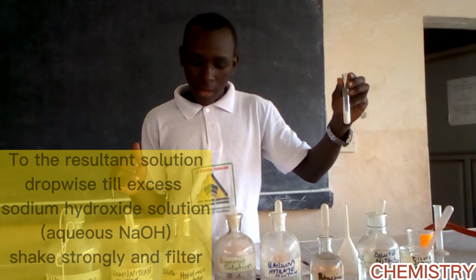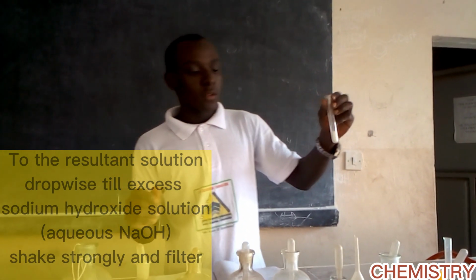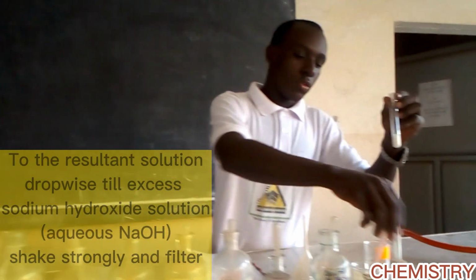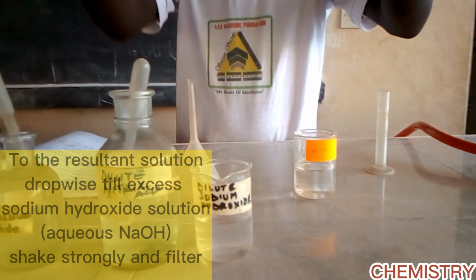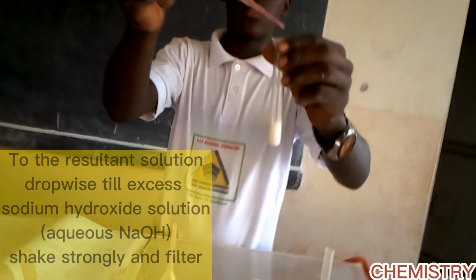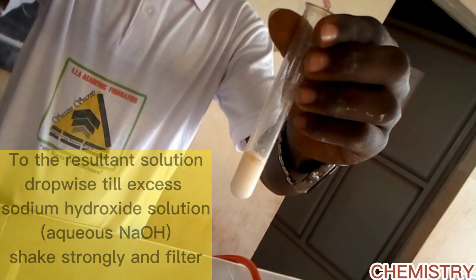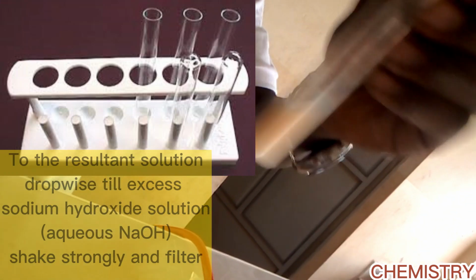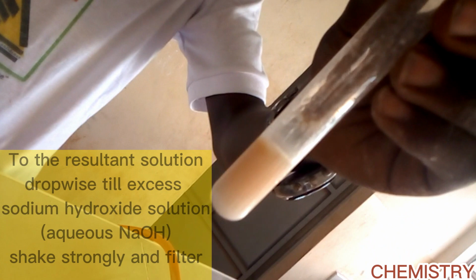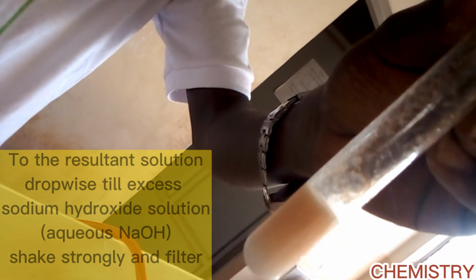To this white solution, they have said add sodium hydroxide dropwise and shake strongly. So we are going to add our sodium hydroxide, which is here, dropwise. As you can see, I'm doing it. They have said until in excess, so you make sure you add the sodium hydroxide. As you can see, the more sodium hydroxide we keep on adding, the solution keeps on turning brown.